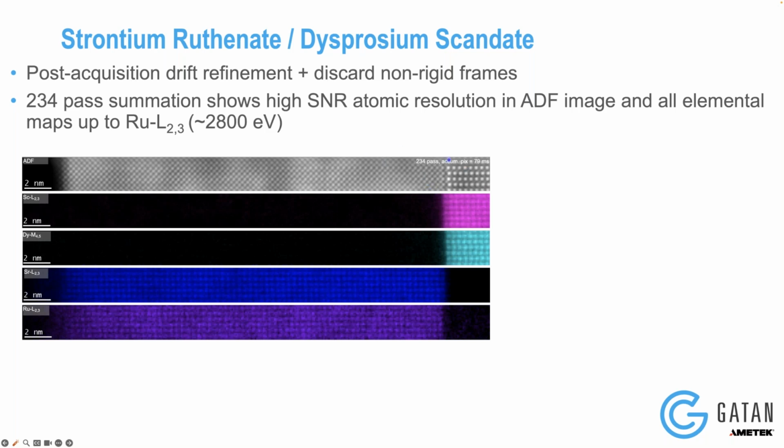And I think it's the high speed, being able to add data without paying the noise price, and the drift rate being low enough with respect to the scan time that the algorithm can correct these subatomic shifts, so you don't get unit cell hopping if you set it up nicely.